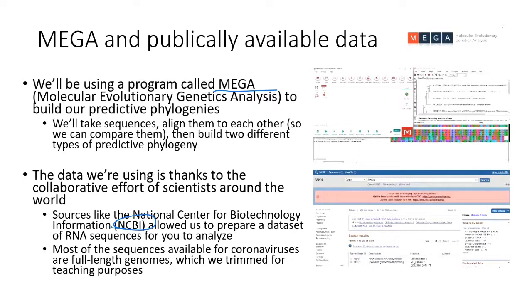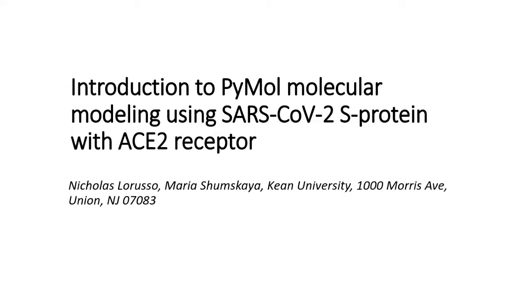This is the module we designed for you. So today we're going to play with the S protein from coronavirus. It's a spike protein. It's a protein that is located on the surface of coronavirus, and that's the one that is going to contact the ACE2 receptor on our cells. It is definitely not designed for the virus.